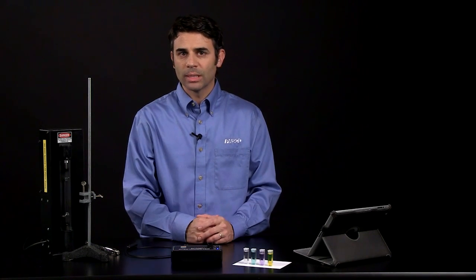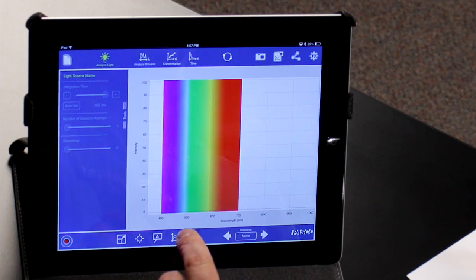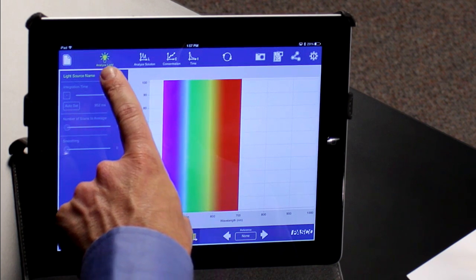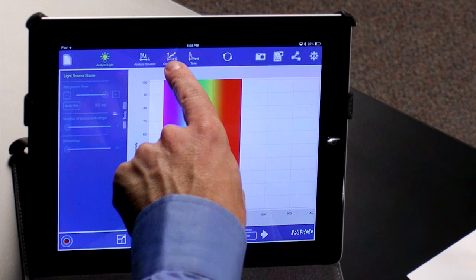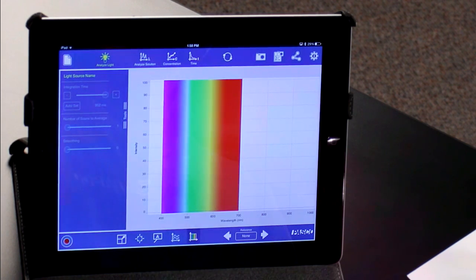So let's dive in and see how we can use the spectrometer. If you look at the spectrometry software, you can analyze lights, you can analyze solutions, and you can do concentration and time analysis studies.